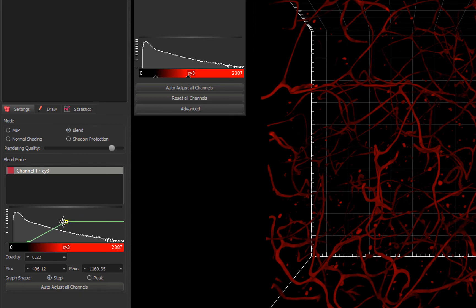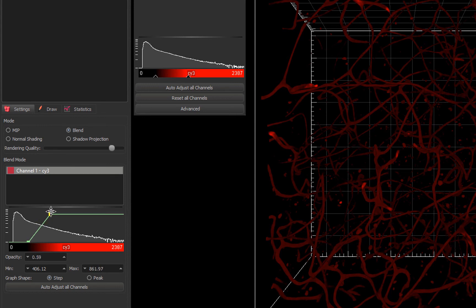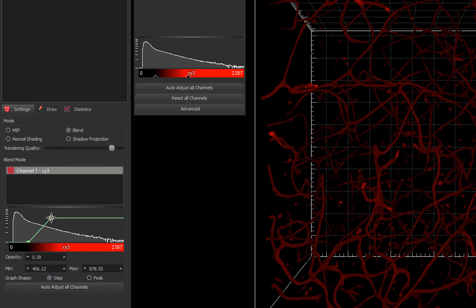By moving the second control point, I adjust the opacity. As I bring the point down, you see an apparent change in brightness as the low intensities are now less opaque, and the high intensities are seen.